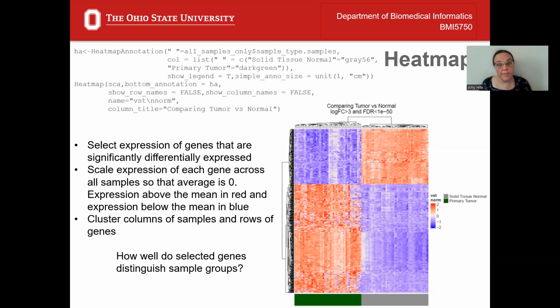And when we plot the heat map with this subset of genes, it perfectly separates our samples. If we were to use a p-value cutoff instead of an adjusted p-value cutoff, if we were to include genes that were not differentially expressed, maybe all of the genes we tested, and did a heat map, it probably would not perfectly separate out the samples.